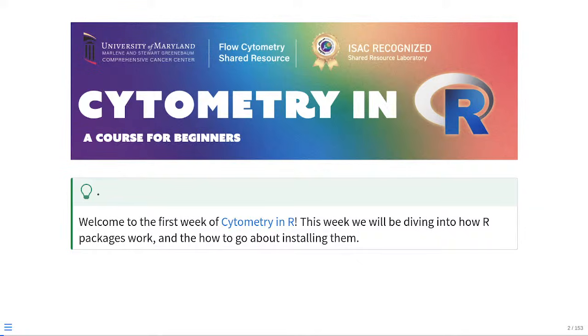Now, if you happen to be at one of the institutions where people are already using R for their flow cytometry analysis, you are set. But if you're at one of the institutions like mine, where our bioinformaticians have no idea what to do with a flow cytometry file, you're kind of out of luck. And what makes it more difficult is there are very few resources online to learn how to do it. You will eventually find them if you're searching for a while, but when you do encounter them, a lot of them tend to be aimed at those who have intermediate R experience or aimed specifically at an established bioinformatician who's just trying to learn how to do the flow cytometry side of the analysis.